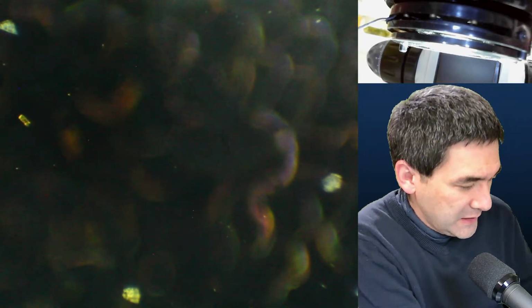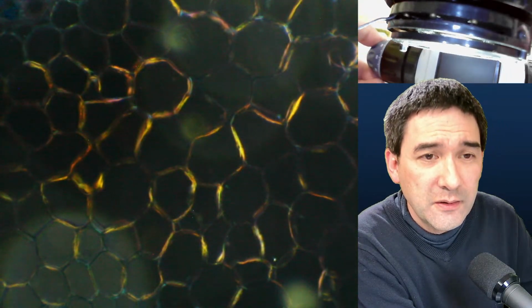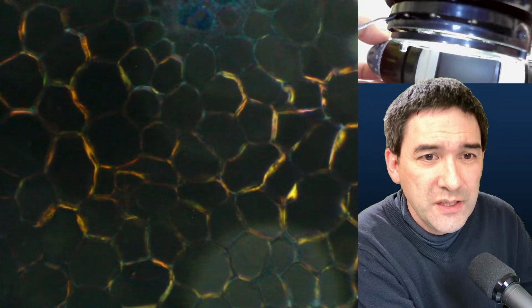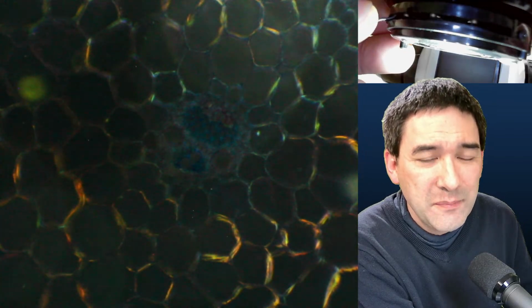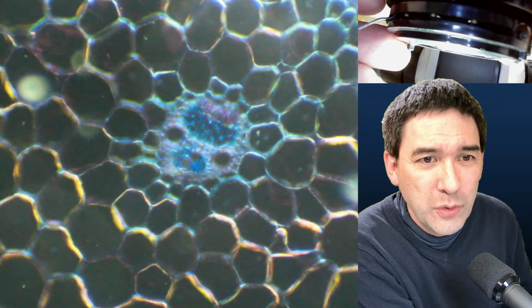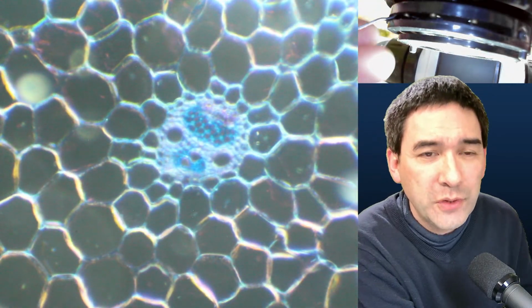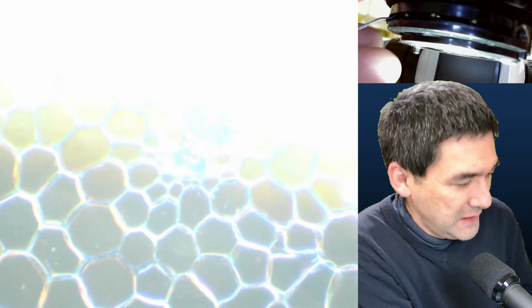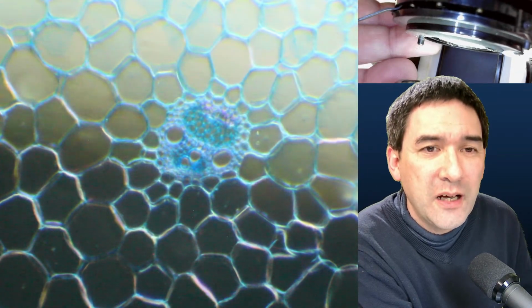maize, which is corn. Here again I have to find the place, and here we are. You see, it's a similar situation. These are the cell walls, but it is not quite as easily visible. So I'm going to open it up again to allow a little bit more light in. You see that the background also starts to light up. Let's turn it down again a little bit, and we can also see now.